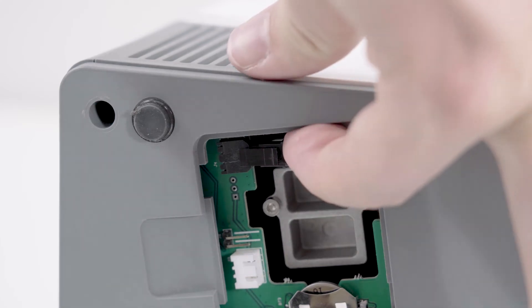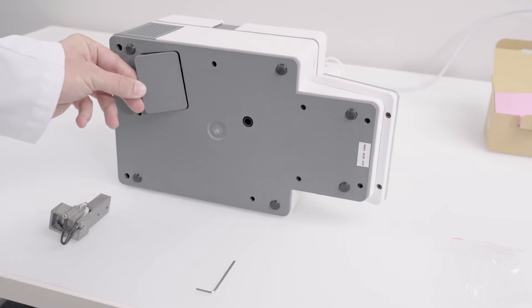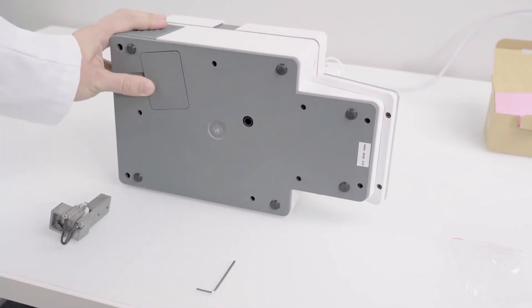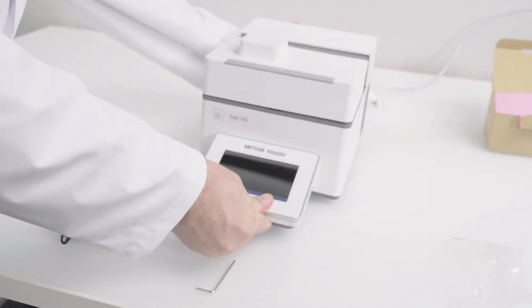Insert the lamp plug into the lamp socket and close the cover. Return the instrument to its upright position and plug in the power cable.